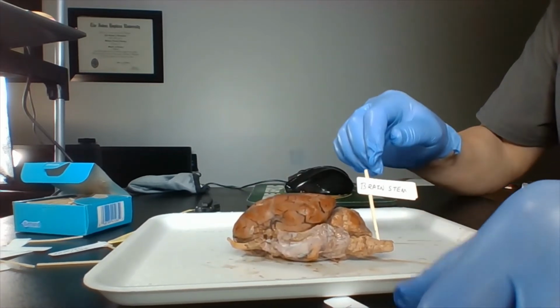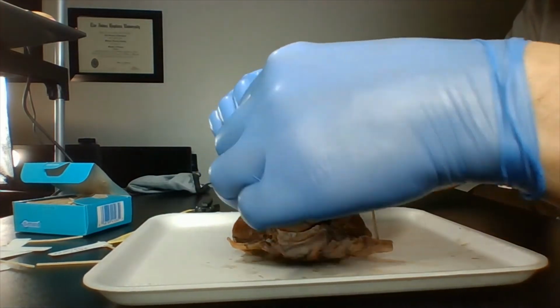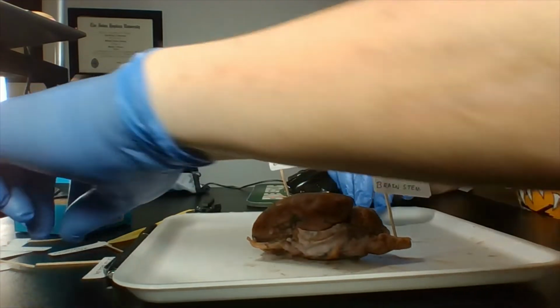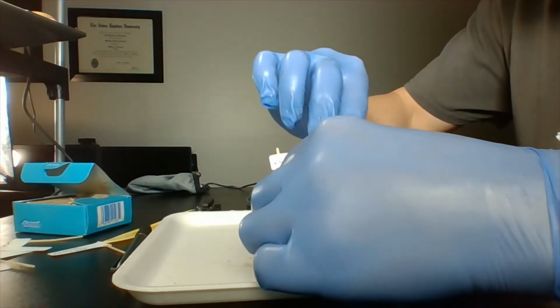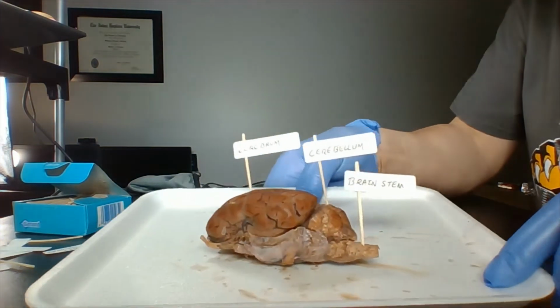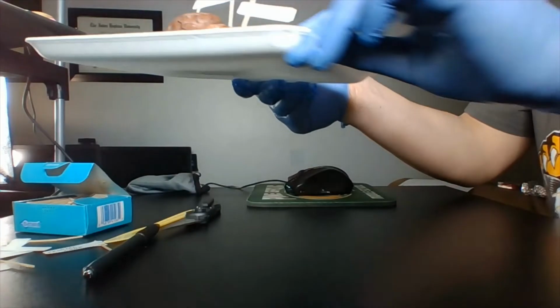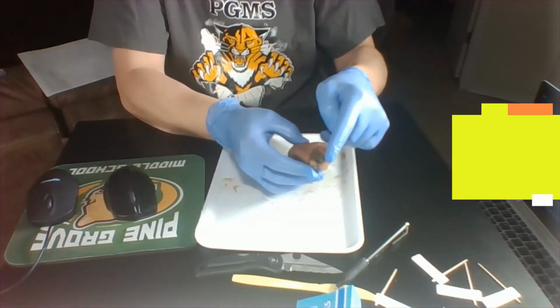So we have the brainstem. We have the cerebrum, which is the big part. And we have the cerebellum, the little part in the middle. And I'll push that closer, and to the other camera. The front of the brain.